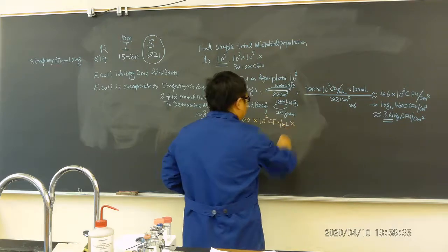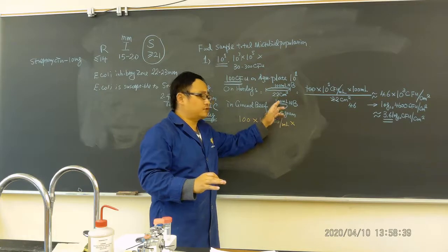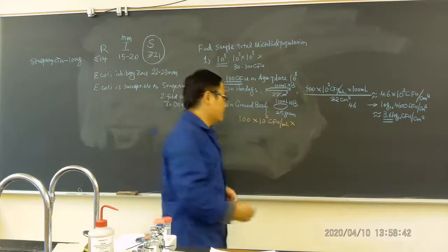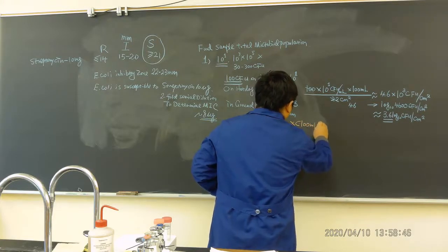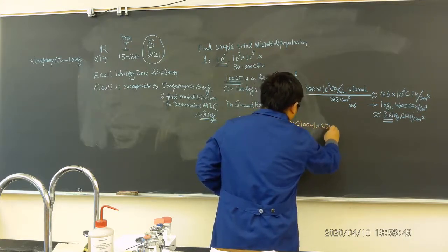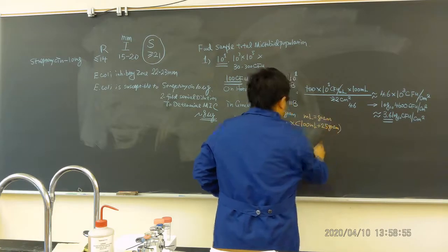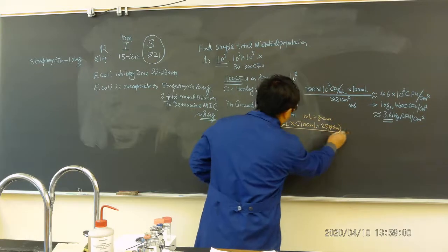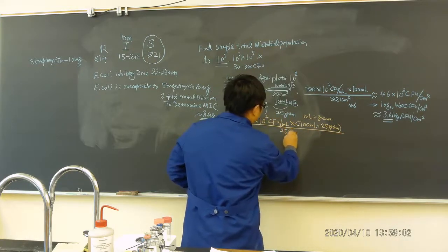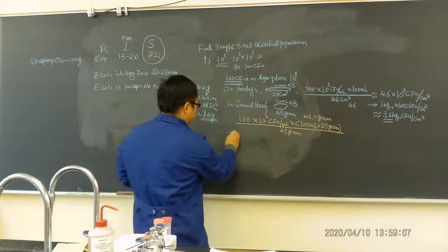Now, since we homogenize, we think this ground beef and this volume are combined together. Therefore, here you're going to have 100 ml and add 25 grams. Now, if you learn physics, you know ml equals gram at this moment, so we can add them together. Those come from this 25 gram ground beef, so we divide it. Then what do we get?